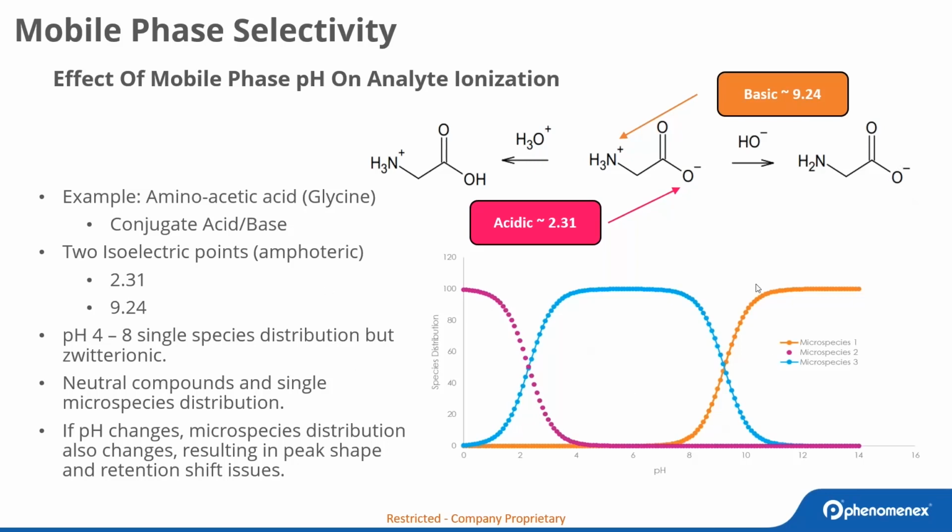So these charts can be very helpful in picking a pH to work with. And ideally, again, you don't want to work at this pKa and this pKb. These are the ones that you want to avoid, and you really want to avoid 2 pH units above and below that, because you see that they're drastically changing.